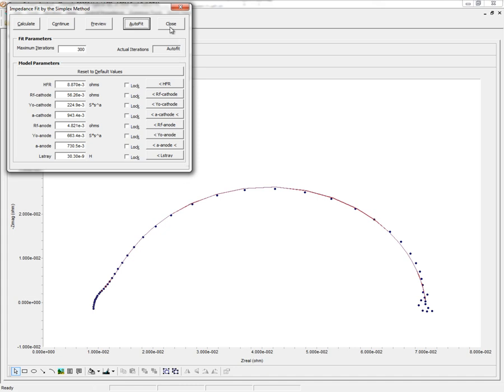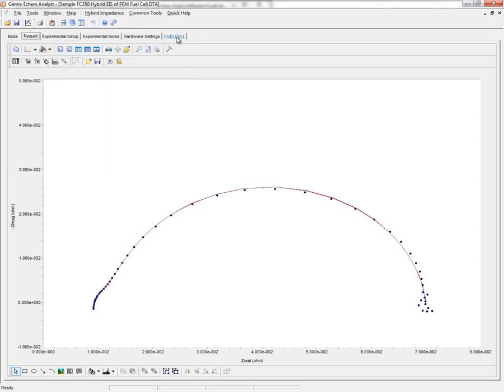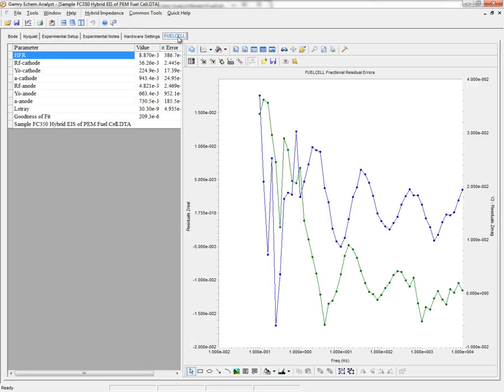Once that's done, I can click Close, and then I can click on the Fuel Cell, and I can see the new values for that Autofit.